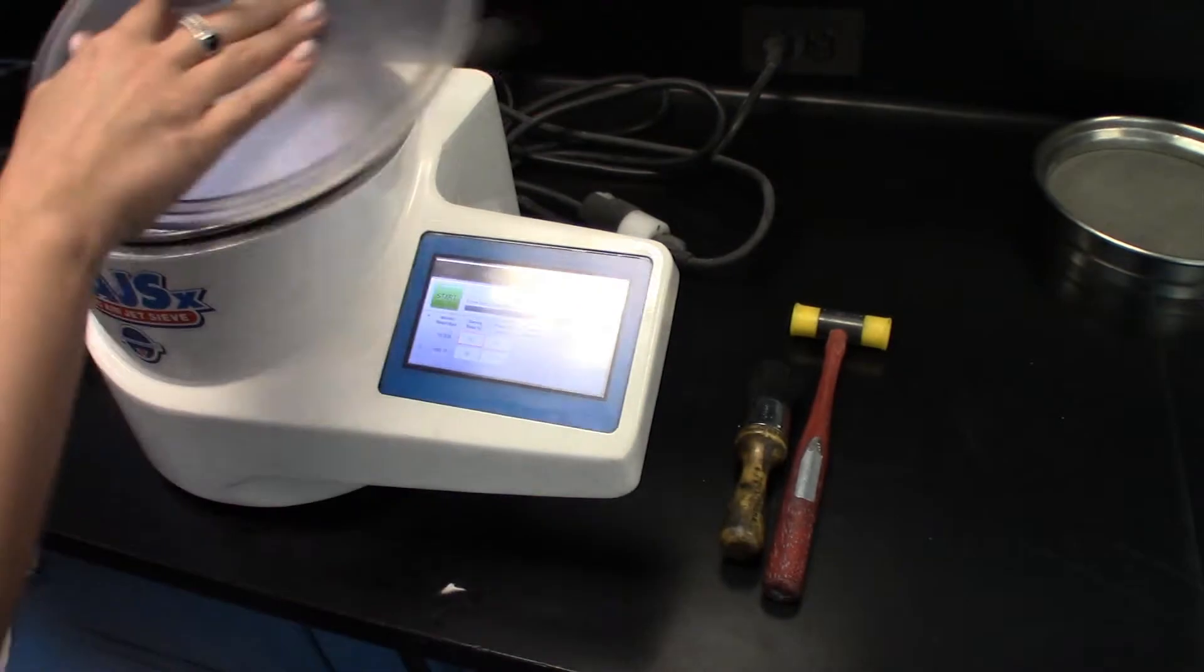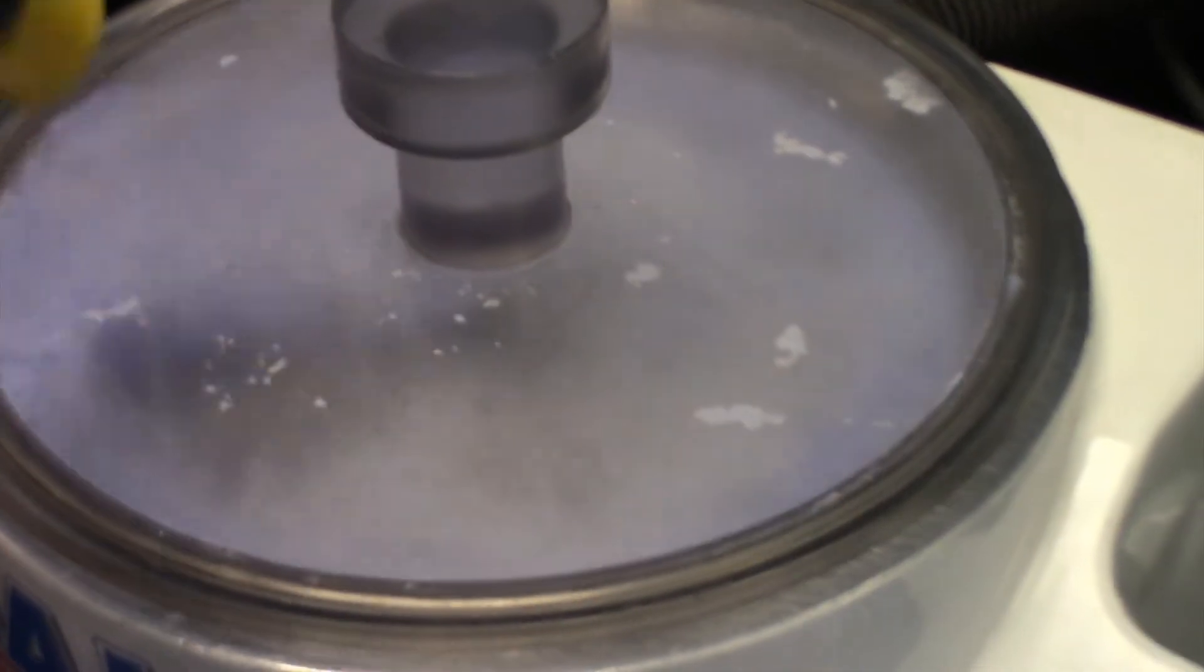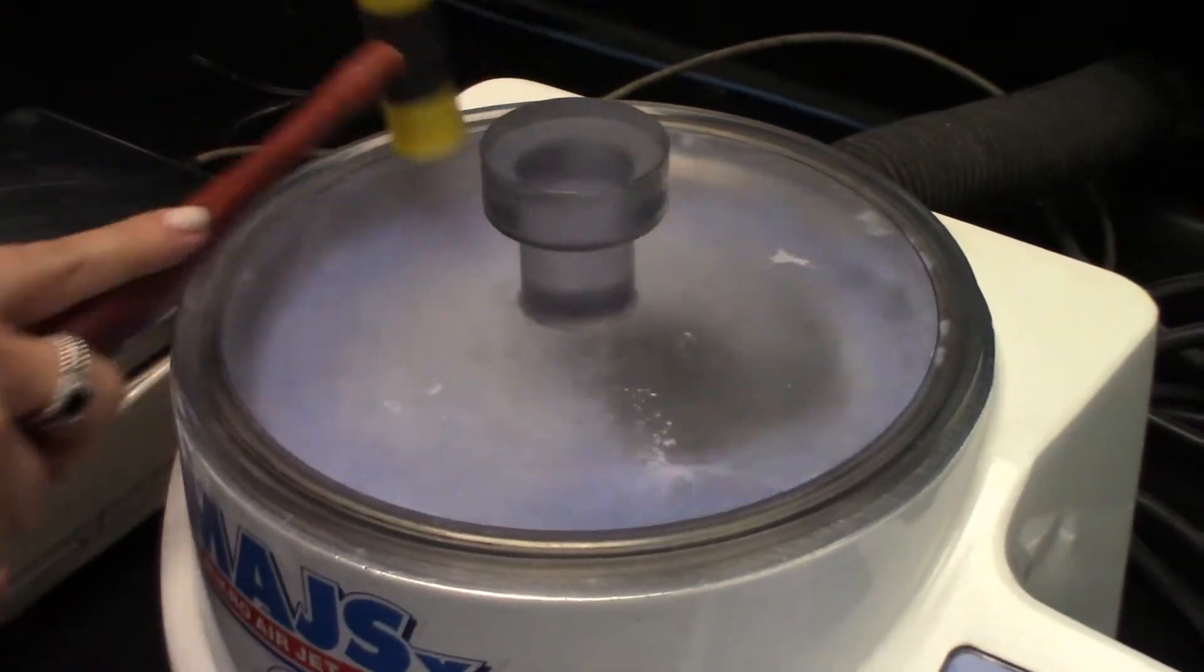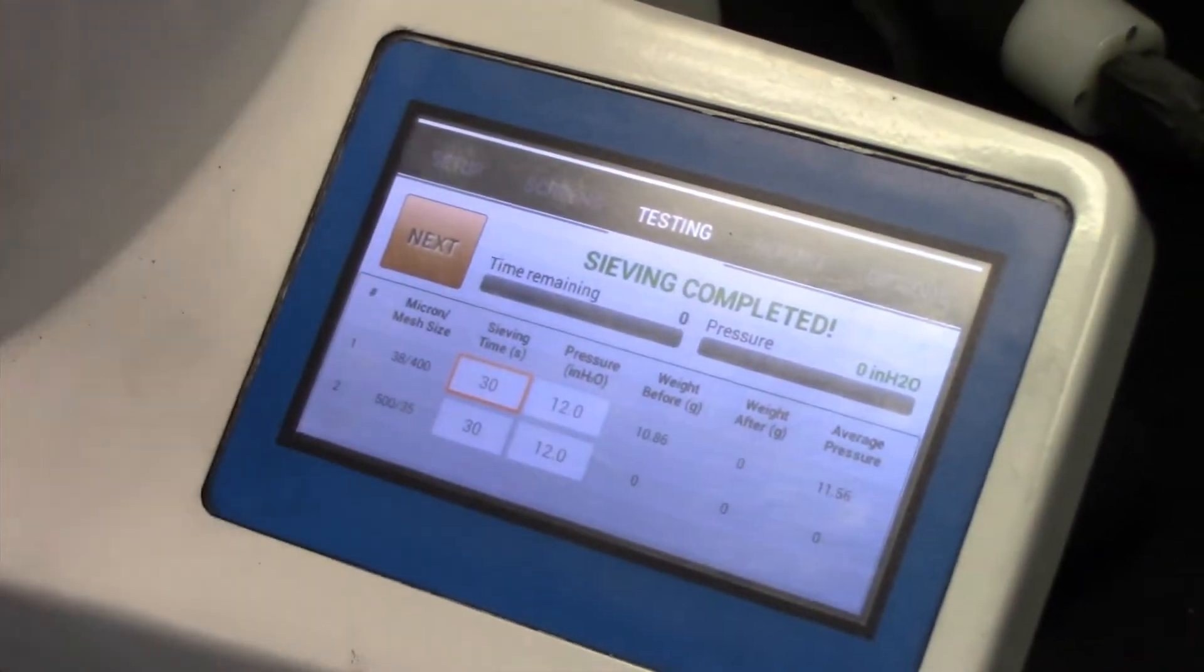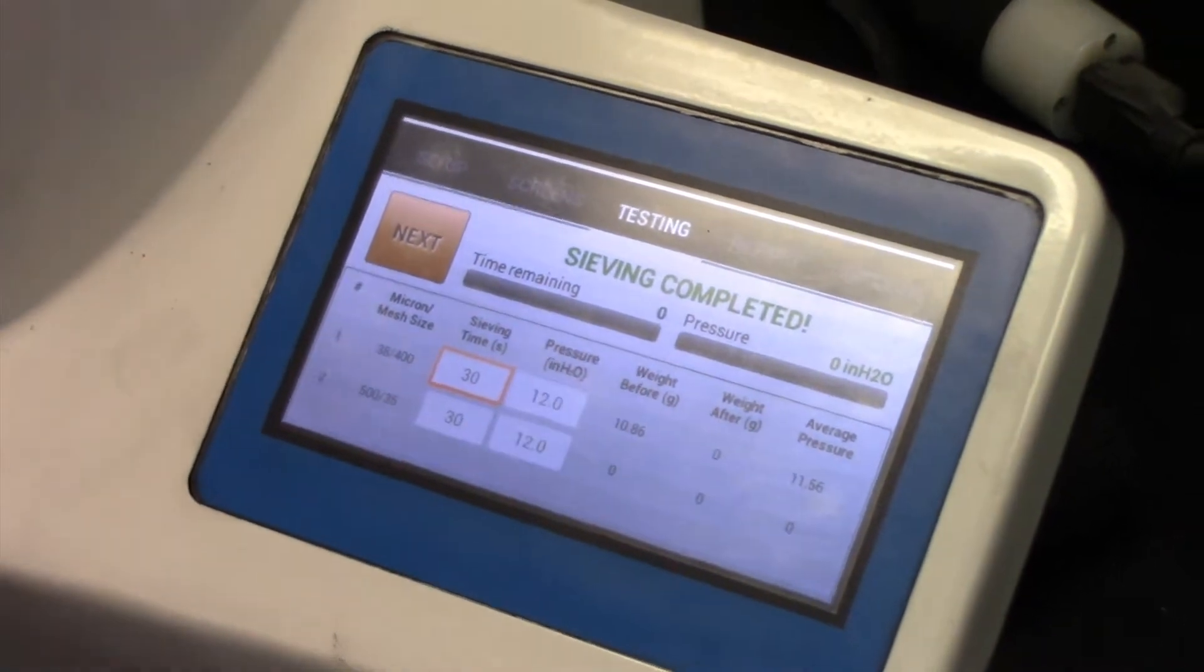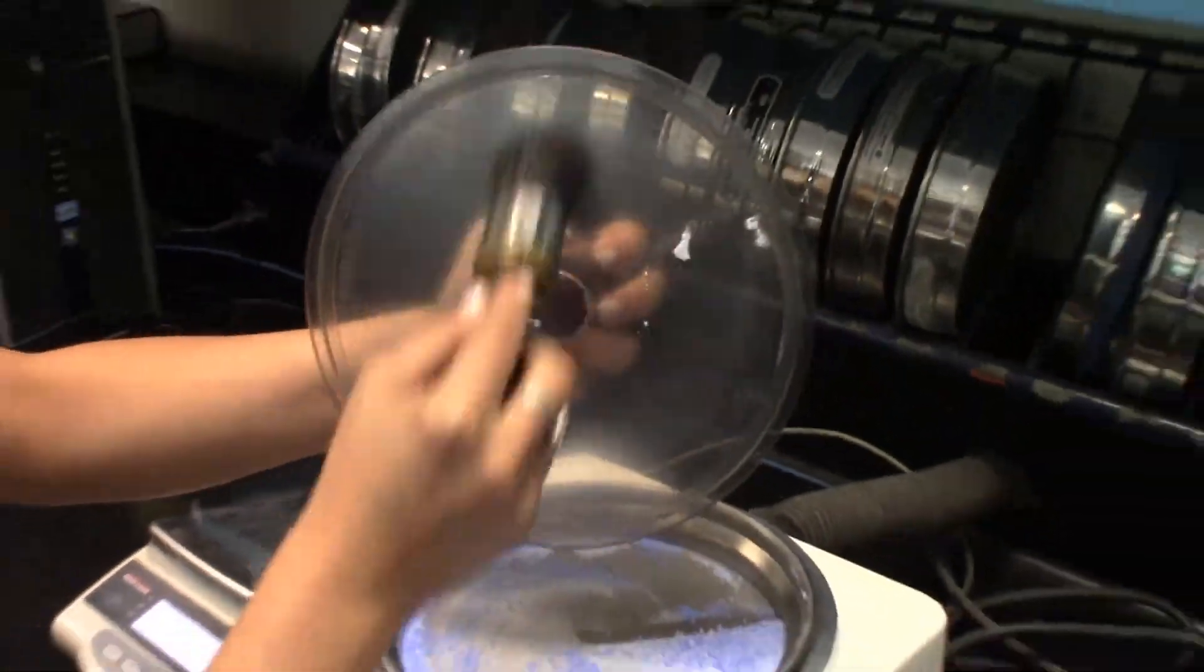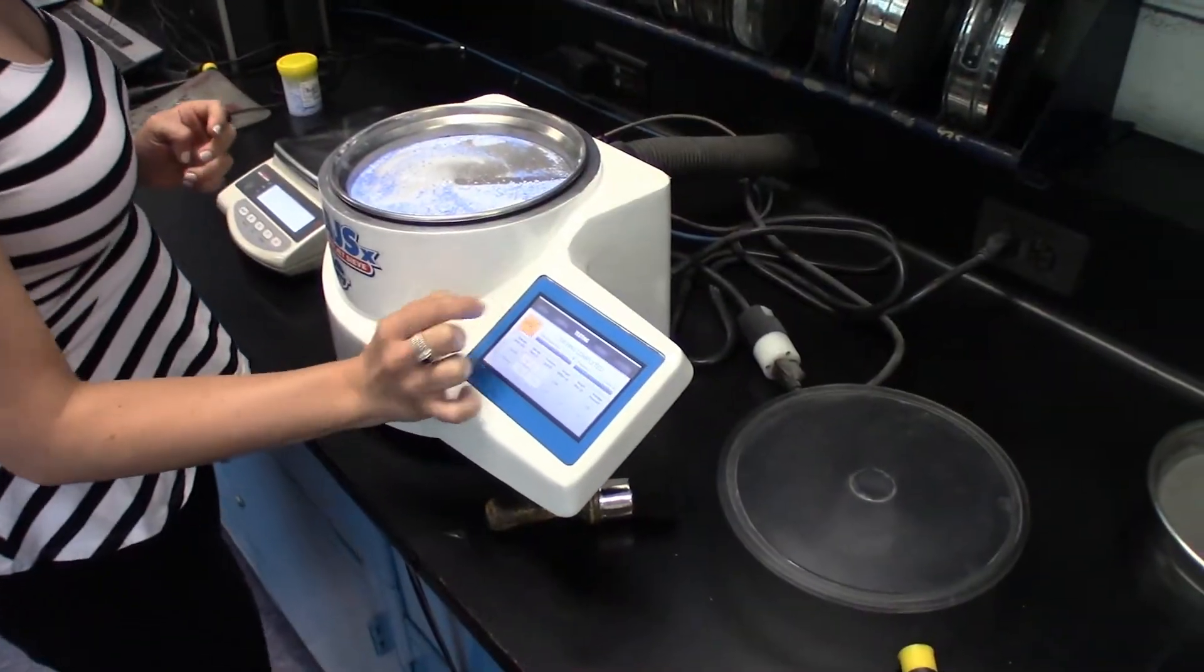Take your lid and start. Brush off any extra that might have clung to the lid. Next.